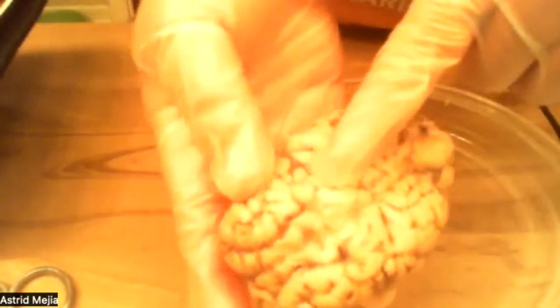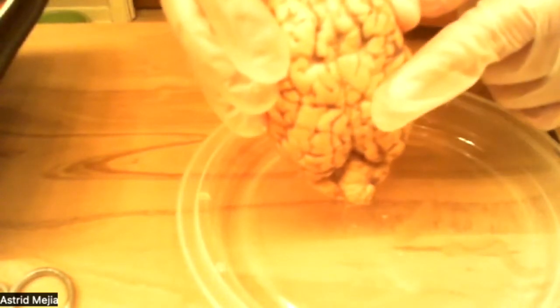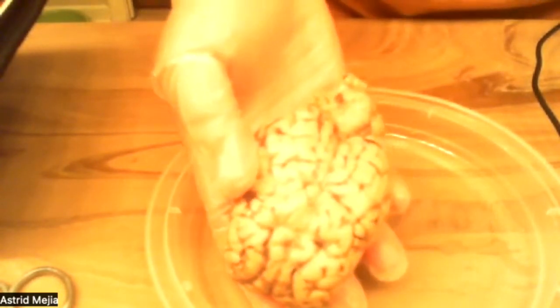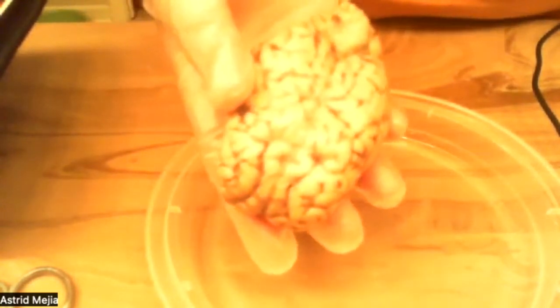And then for the right hemisphere, which is this one, basically it controls the left hand side of the body, and it receives information from the left visual field, which basically controls our creativity, the context, and it helps us recognize faces, places, and objects.